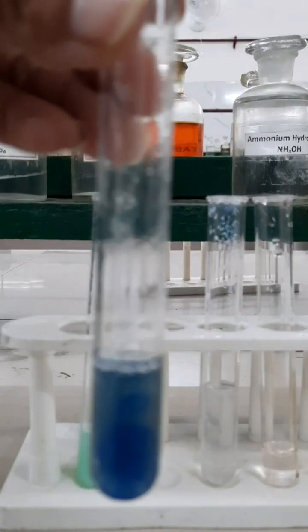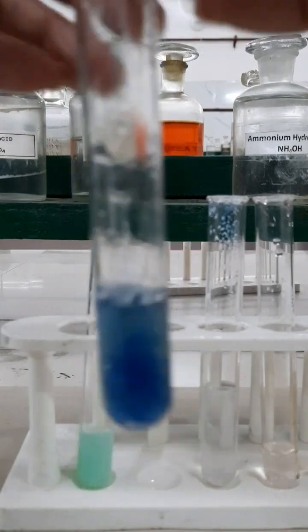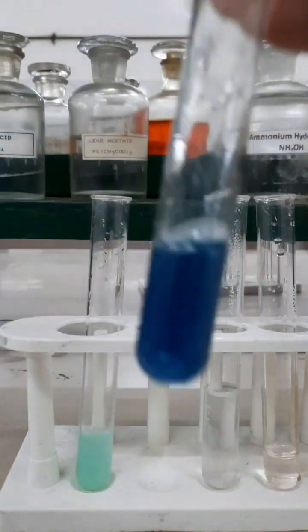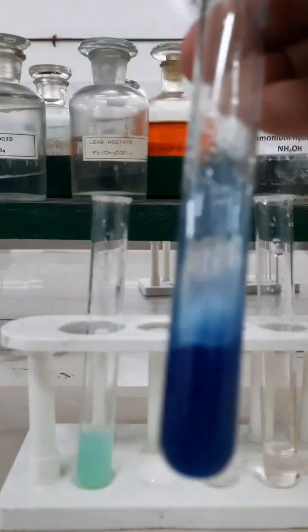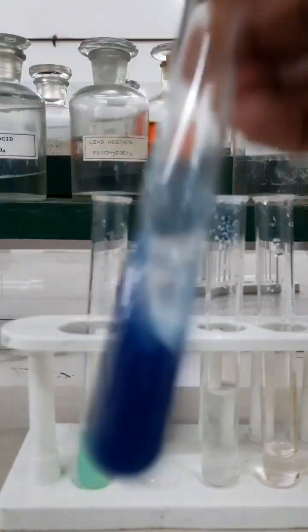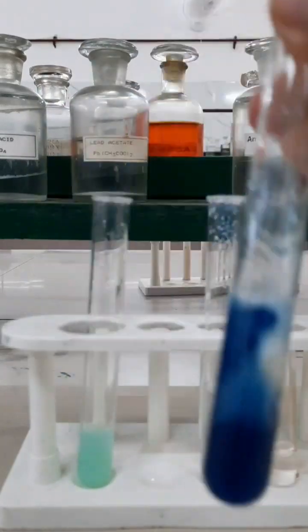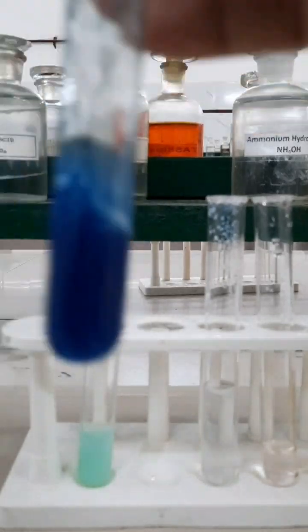Now on adding excess of sodium hydroxide solution into it, a deep blue colored complex of tetrahedral cobalt hydroxide will be obtained, and this will confirm the presence of the cobalt 2+ ion.